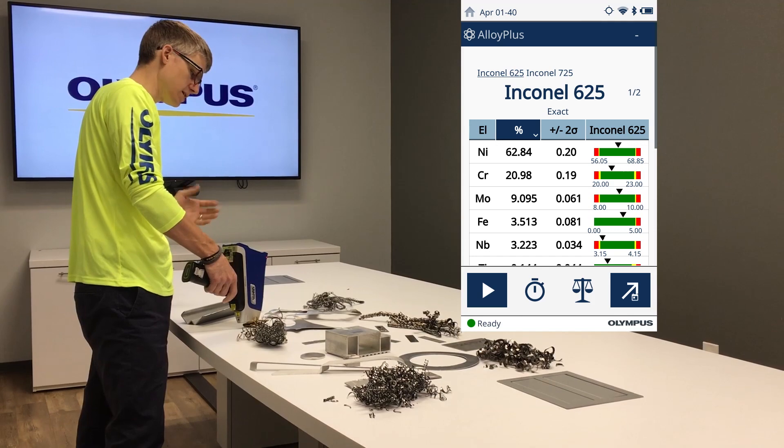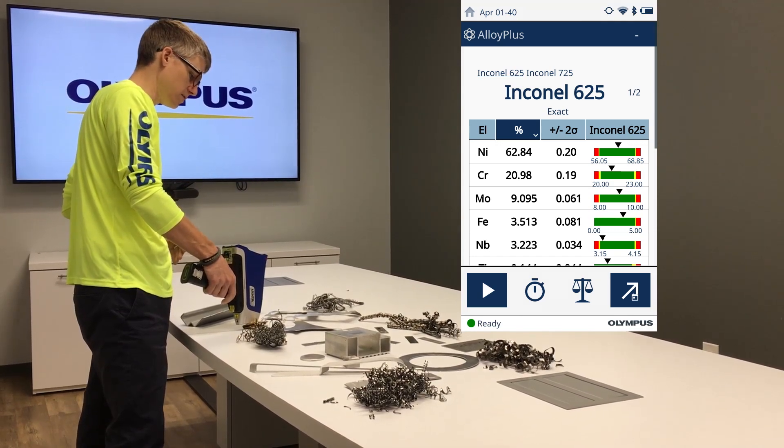You can hit your red metals here. It doesn't matter whether it's titanium, ferrous, copper. Here's some lead and brass — copper 353.